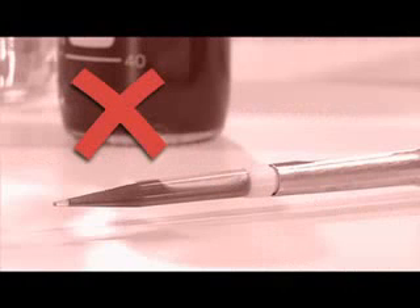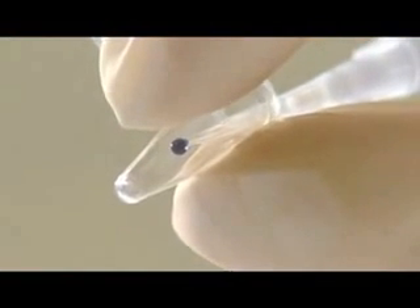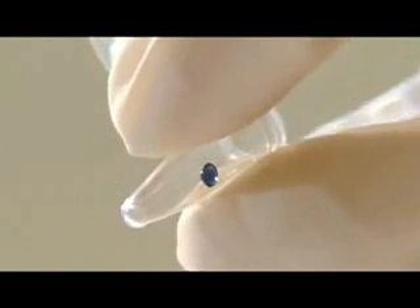Whenever you have liquid in a pipette tip, don't lay the pipette down. Liquid can get into the body of the pipette, which causes cross-contamination, pipette damage, and inaccurate pipetting. And finally, remember when pipetting small volumes, touch the pipette tip to the side of the tube to ensure the liquid is released into the recipient container.